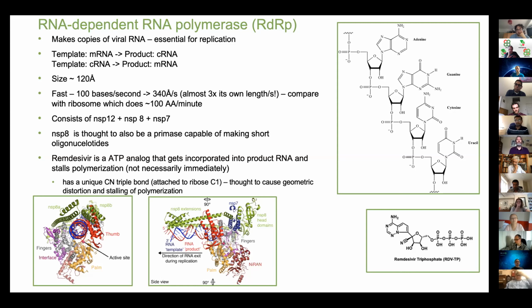So from my perspective, I wouldn't be surprised if there is a certain amount of fuzziness in the placement of the RNA, because we have something which has to move quite quickly. You don't have very strong bonding. So if the resolution of the RNA was lower than the rest, I wouldn't be surprised. And I wouldn't be surprised if you have to use special focused classification methods and so on to get a closer picture.